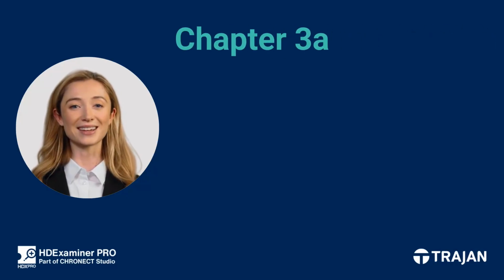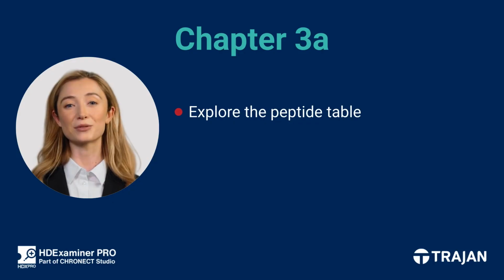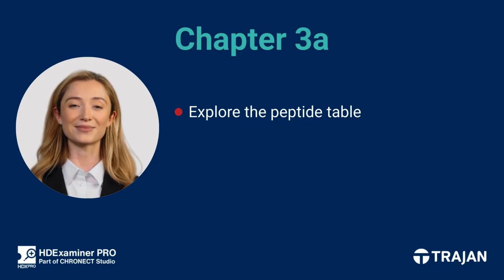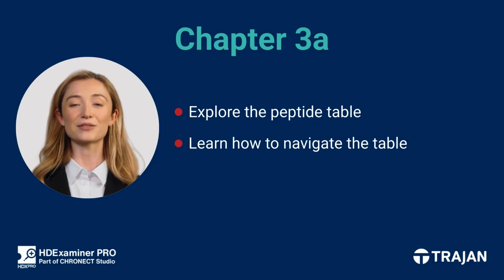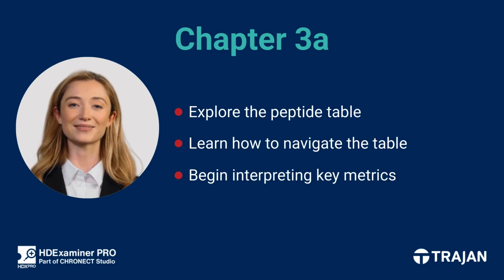Welcome to Chapter 3A. In this segment, we'll explore the peptide table, your central workspace for reviewing all processed peptide data. You'll learn how to navigate the table, filter results, and begin interpreting key metrics from your HDX experiment. Let's take a look.